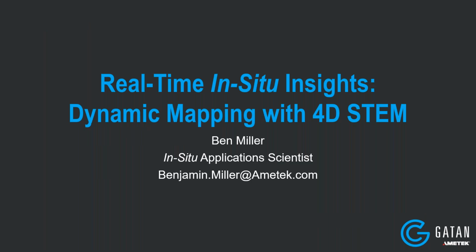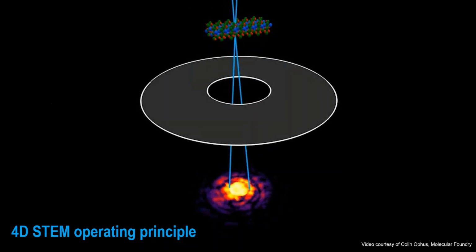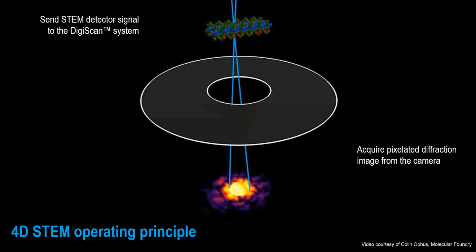Yeah, thanks, Jonathan. I'm excited to present today about how we can get real-time in-situ insights with 4D STEM, doing dynamic mapping in real time with 4D STEM. So the first thing that I'll show today is the operating principle of 4D STEM. And this is a really nice video put together several years ago by Colin Ophus, showing what we mean when we say 4D STEM.